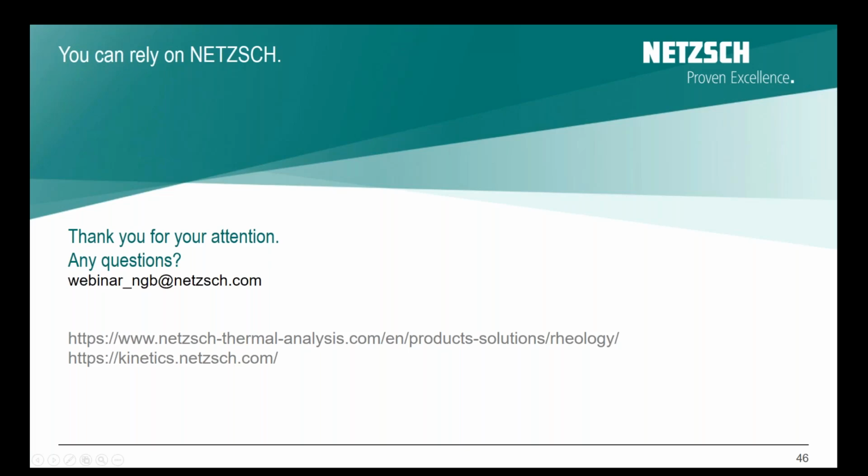Thank you, Adrian and Elena, for your nice talk. Really hands-on. We have a few questions coming in, and I think we could answer one or two. I have a question here: do the DSC and the viscosity data give the same kinetics?